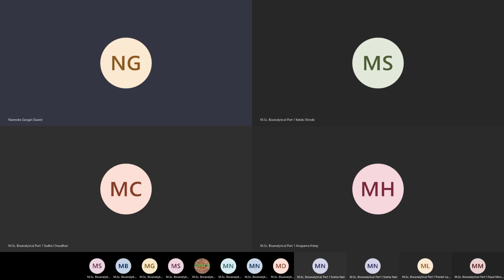We discussed the requirements of various ionization techniques. Why? Because different molecules have different properties, and some molecules may give me the molecular ion and fragments using some ionization tools. We took the example of a chalk and a duster. If I put a large force on chalk, it will completely get powdered, whereas the same force on a wooden duster may just fragment it into 2-3 big pieces.